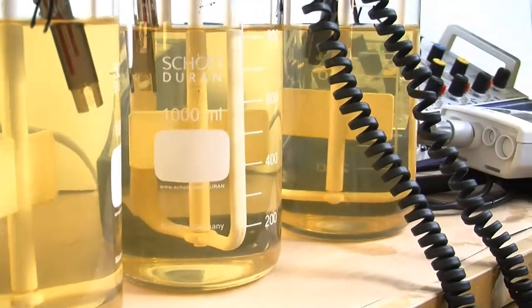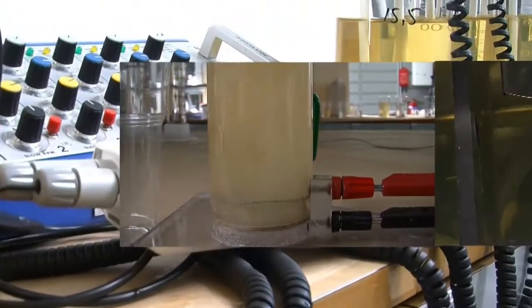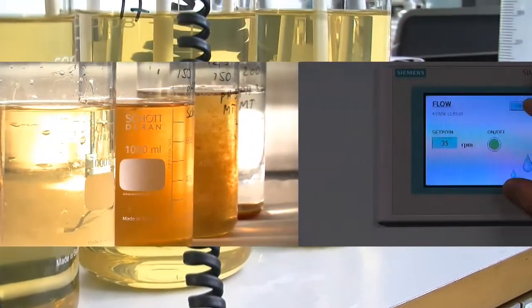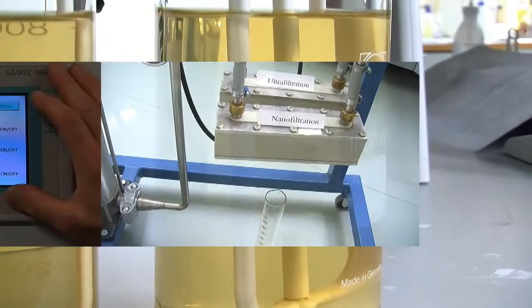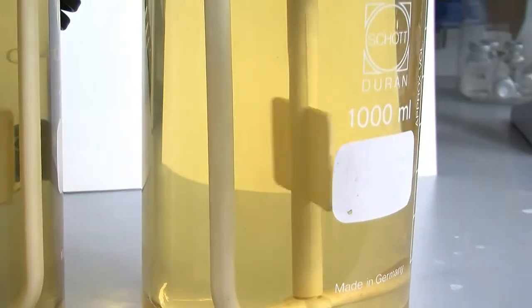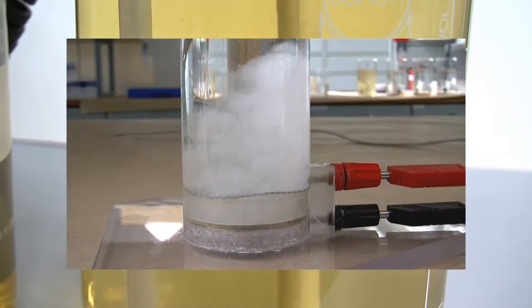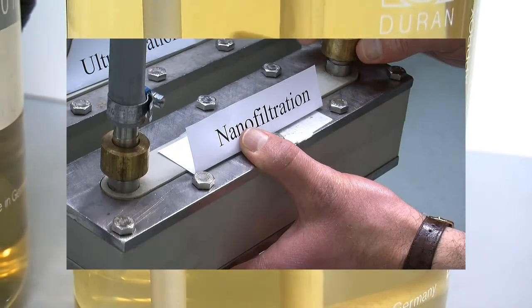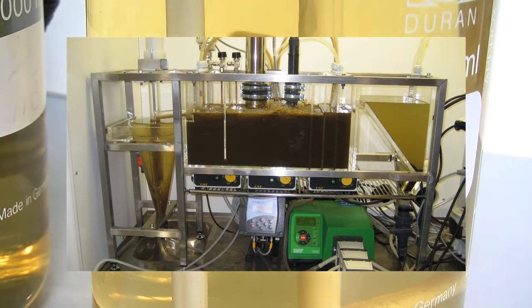In addition to ordinary jar test apparatus and the most common analytic facilities, we have a few laboratory and pilot-scale apparatuses that can be used to demonstrate the most common processes and operations on water and in wastewater treatment. In this presentation, we'll introduce our pilot-scale Waterworks, benchtop electroflotation cell, pilot-scale membrane filtration unit, and benchtop wastewater treatment plant based on the activated sludge process.